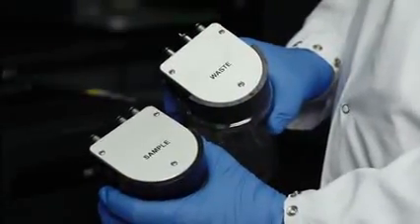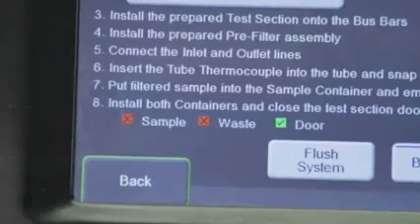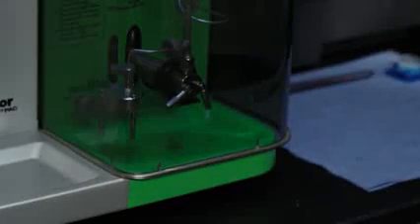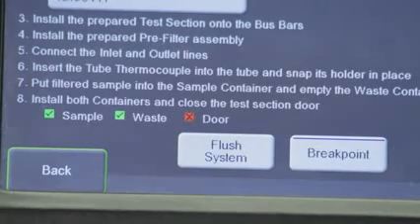The heads are indicated to prevent incorrect installation. Connections to the sample container and the waste container are indicated with a check or an X. Close the test area door. The door status indicator will change from a red X to a green check.